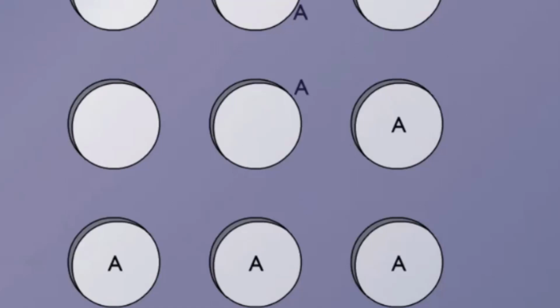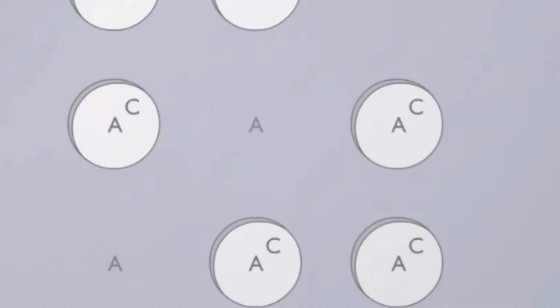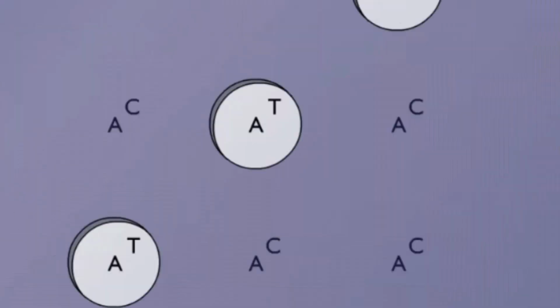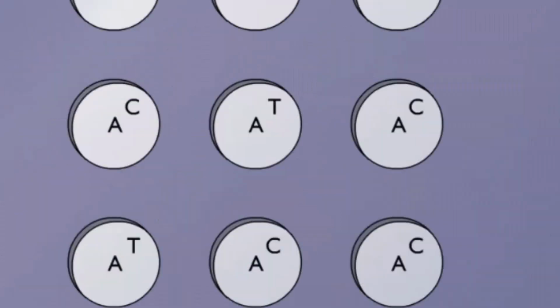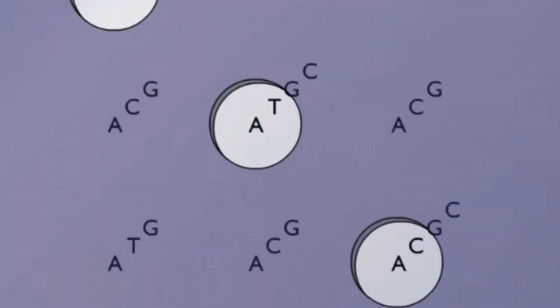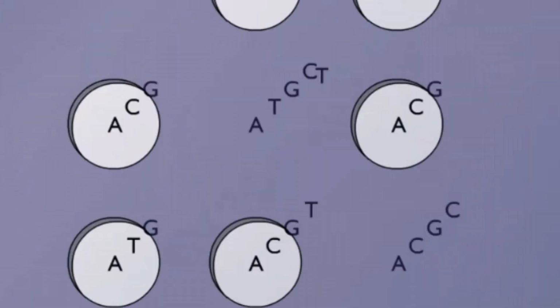The first nucleotide to be attached is added and made to bind by a light activation reaction. The mask is then replaced by another mask which exposes sites for addition of the next nucleotide. This process is repeated until all of the oligonucleotide probes, each with known sequence and position, are synthesized. Although only 5 nucleotides are shown in the nucleotide chain of this animation, they are usually 15 to 25 nucleotides in length in the microarray.